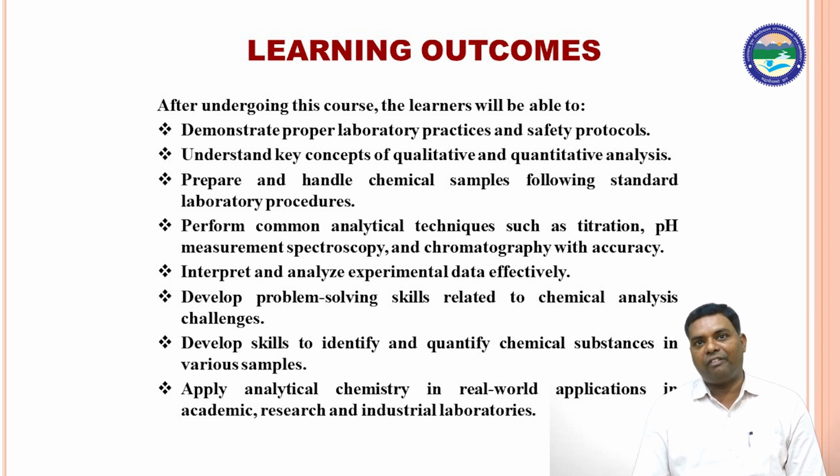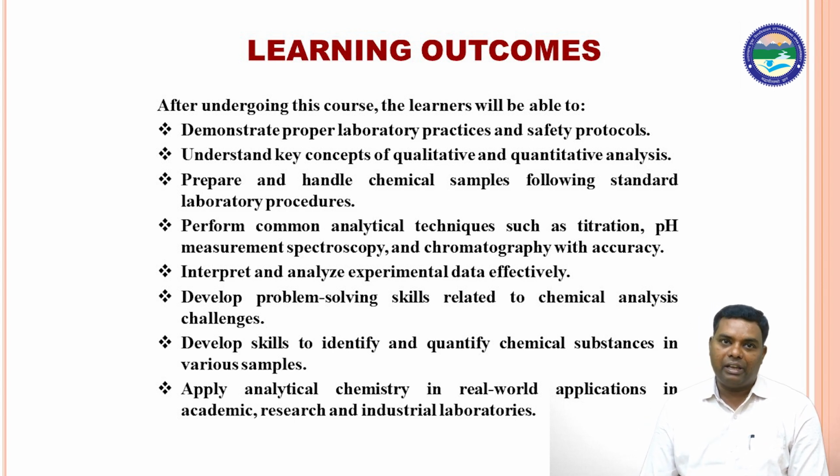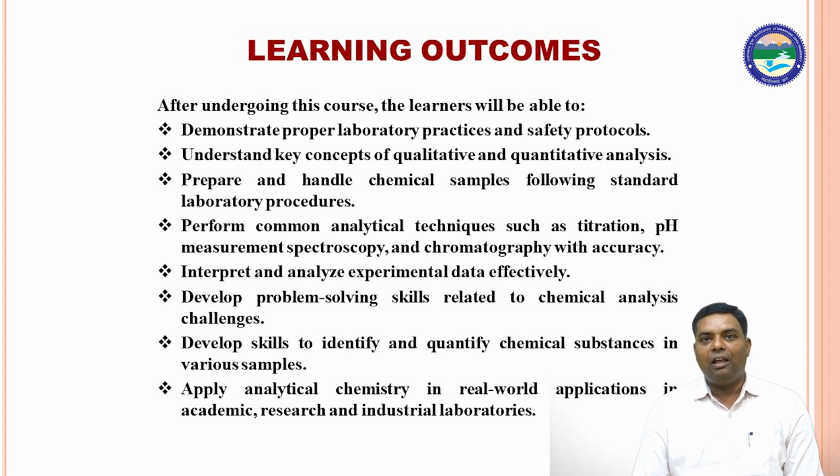After completing this course, the learners will be able to demonstrate proper laboratory practices and safety protocols, understand key concepts of quantitative and qualitative analysis, prepare and handle chemical samples following standard laboratory procedures, perform common analytical techniques such as titration, pH measurement, spectroscopy, and chromatography with accuracy, analyze experimental data effectively, and develop problem-solving skills related to chemical analysis and its challenges.